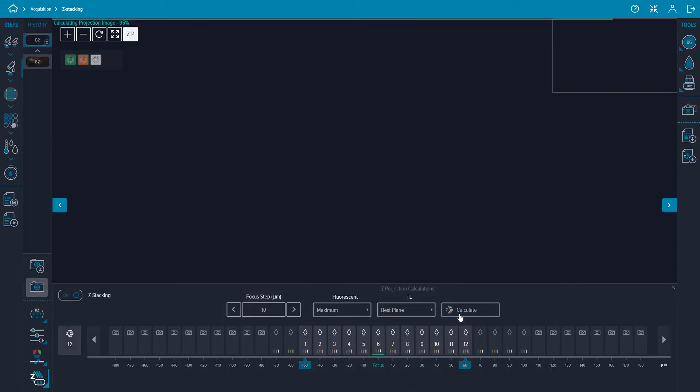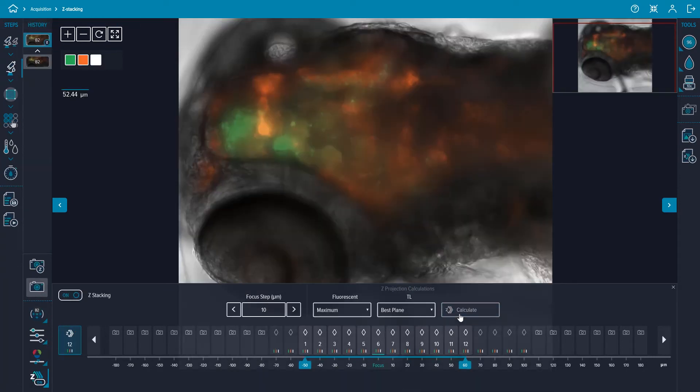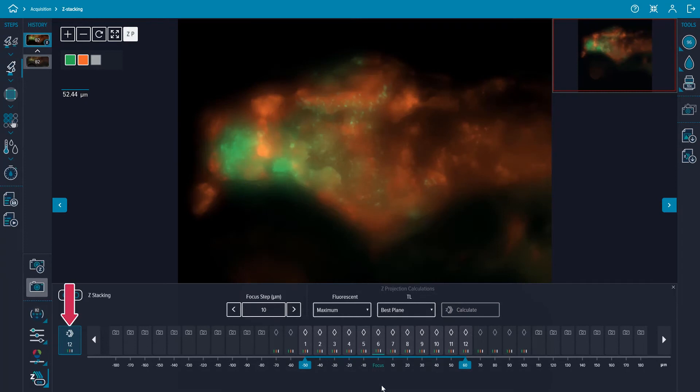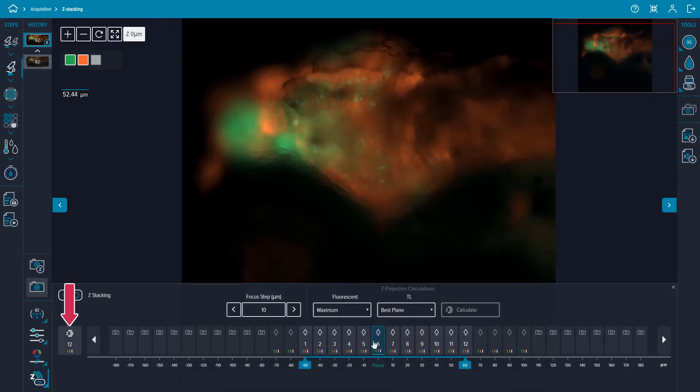To see the difference between a single plane image and the z-stack projection, you can switch between a single plane and the z-stack projection button in the z-stack preview bar.